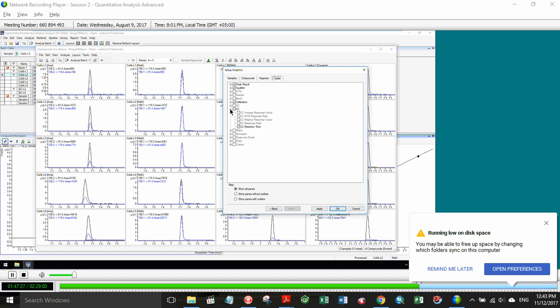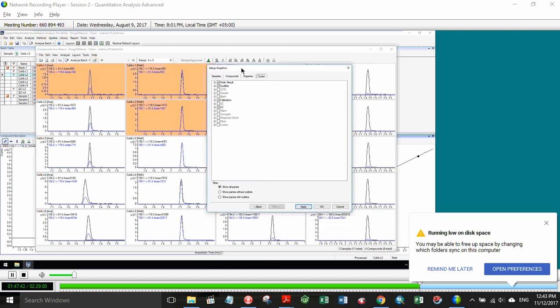And since there are no limits, the calculations won't be done. Just to save us overhead, there's no need in calculating all these outliers if we don't have any limits for it, okay? And if we apply that, we can see we get some nice little visual cues that these are probably some things I need to take a closer look at, okay?